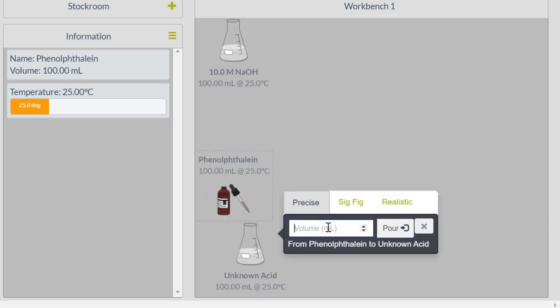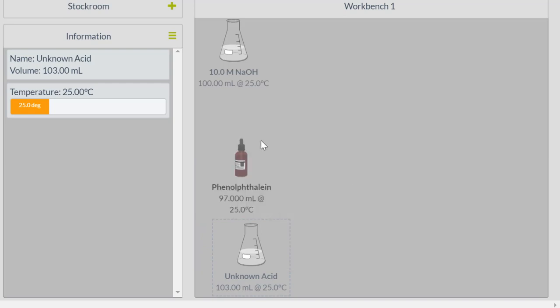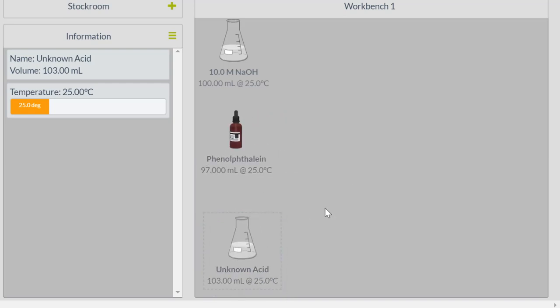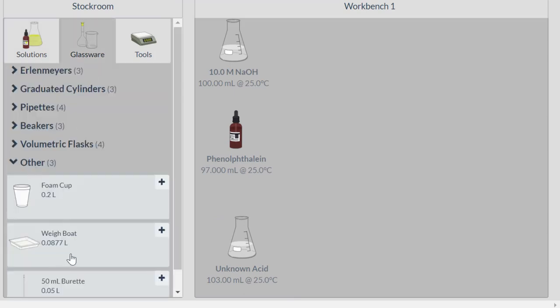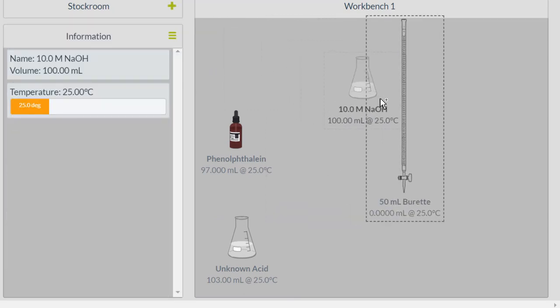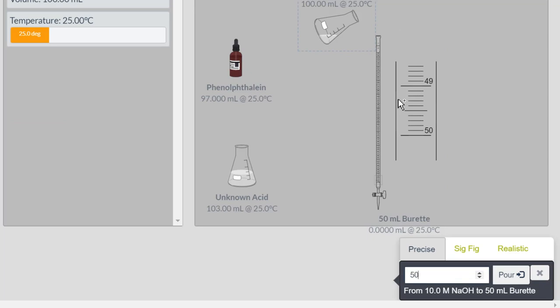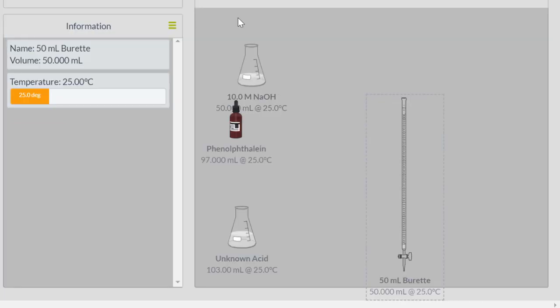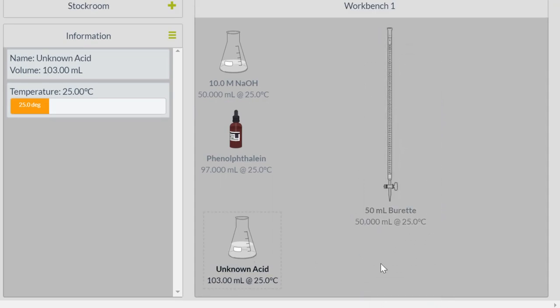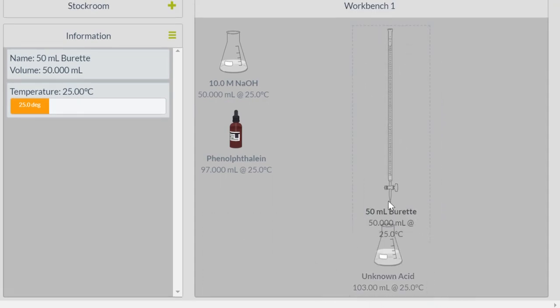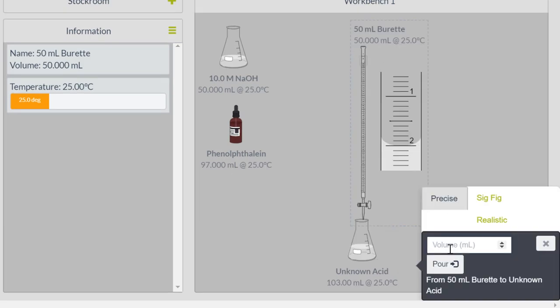Remember, the end point is when the color changes, which means we need an indicator. We need phenolphthalein in there. And so we need one more piece of glassware. That is a burette. We're going to fill this burette up to 50 milliliters with my 10.0 molar of my sodium hydroxide. You can see I have my burette right here. I have my unknown acid. And I'm going to start my titration.